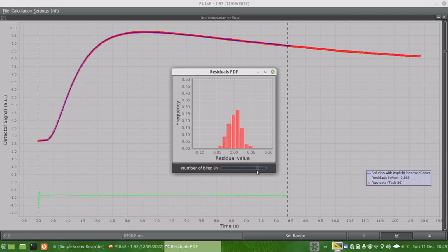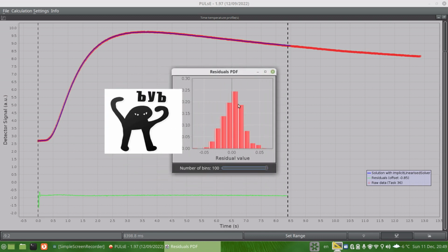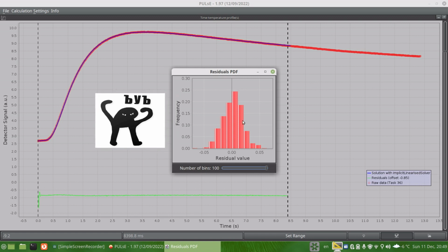And now I'm able to see that actually the residual histogram appears more like a Gaussian histogram, probably. Well, actually the mean for the residuals appears to be slightly shifted to the right, so I will say something about this, what to do with that if we want to maximize accuracy.